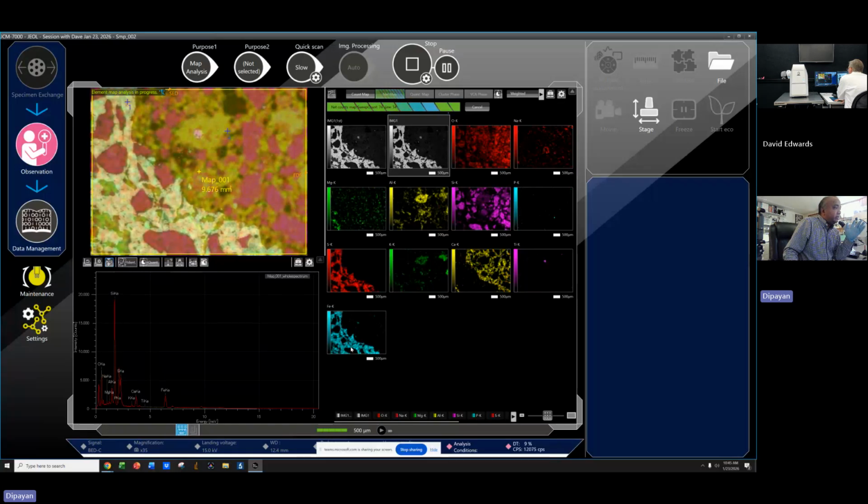Where is my iron? Iron is this blue color, and sulfur is red, but I'm getting a weird color for the pyrrhotite. Right, because neither blue nor red. Yeah, it's putting the red and the blue together and blending that color as if you were a painter blending colors. Yeah, that's what I am thinking. How can I make it? So then, what's going to happen in the color map in the legend? It will say iron, blue, sulfur, red, and people will think, where are they? Right. Correct. It's a blending of colors.